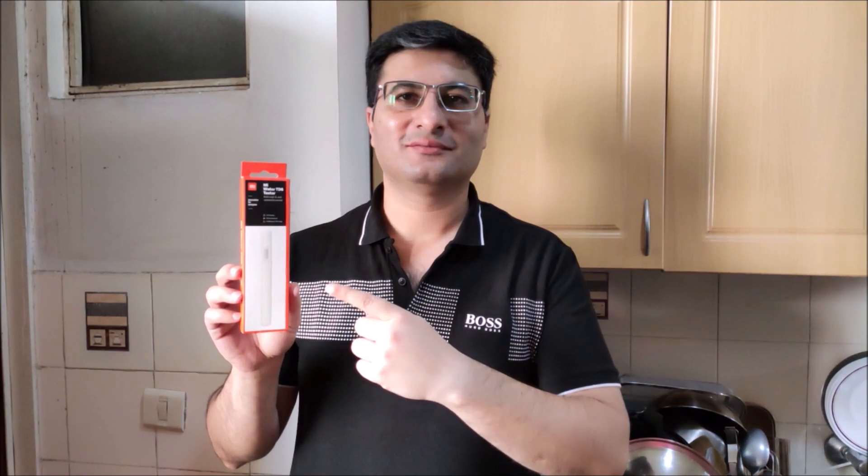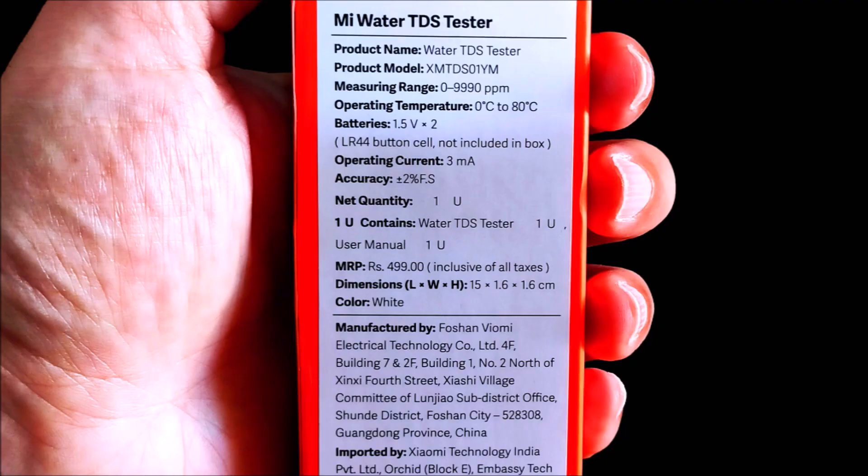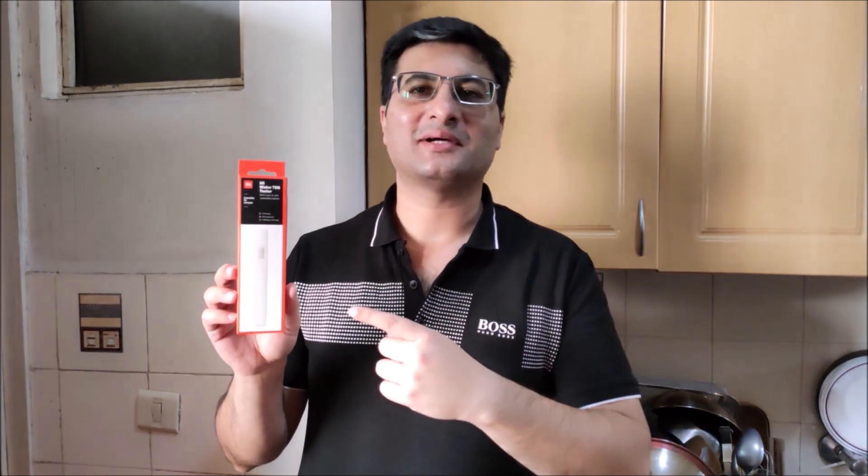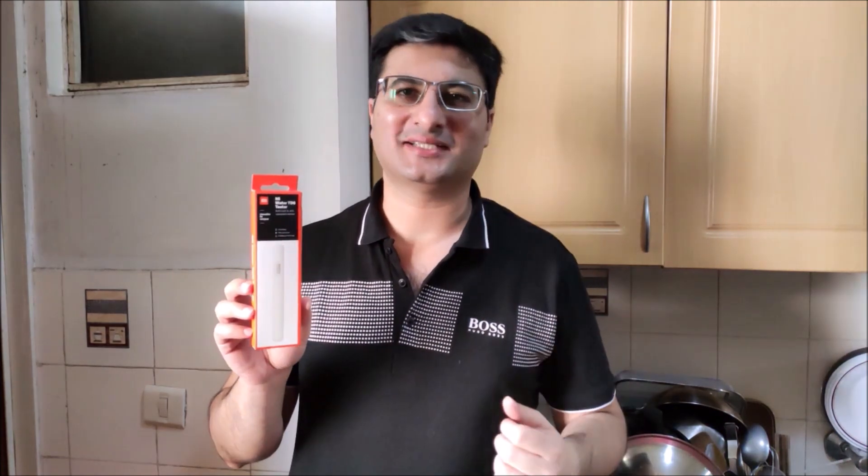The Mi Water TDS Tester is an extremely useful and practical product from Xiaomi. It can be life-saving in certain situations where the water can be checked for quality. The MRP on the box is Rs. 499, but it currently sells on the Xiaomi website for Rs. 349. If you wish to buy it, I will leave a direct link for you to purchase it from the Xiaomi website.